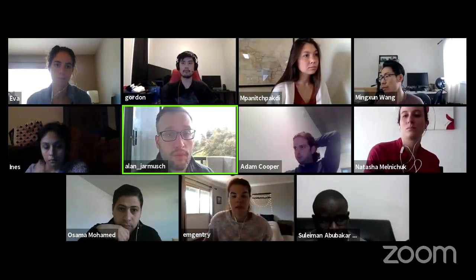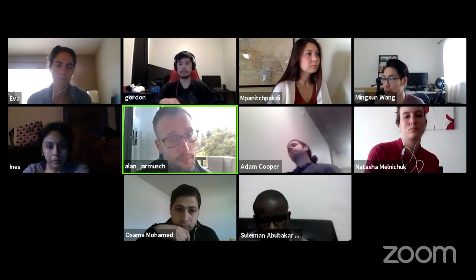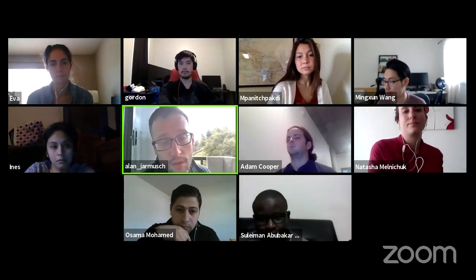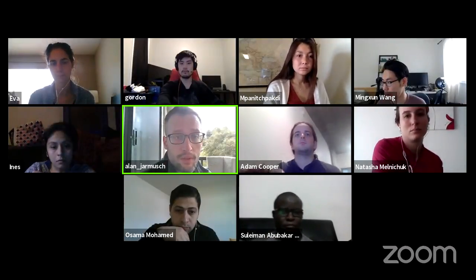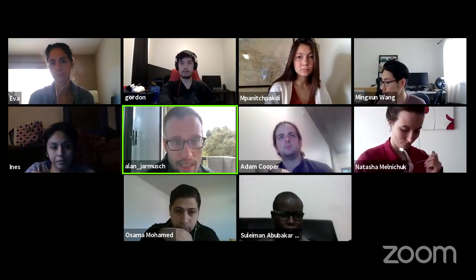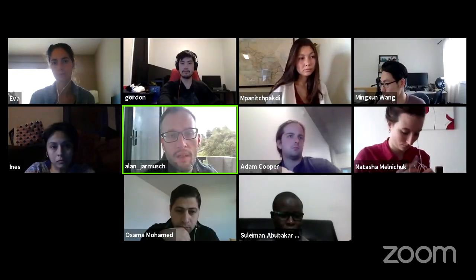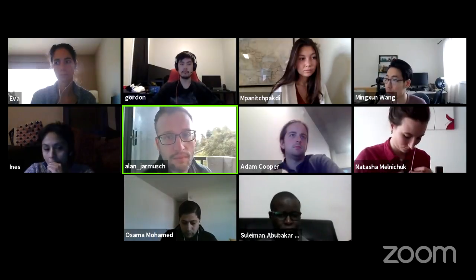And that's where the matching algorithm really is relying on you having multiple peaks and points of reference. Missing one of those doesn't negate a match at all. It just lowers the cosine score. So that's why we generally don't put the cosine score at like 0.99, where it really has to match identically. It's 0.7, it's kind of a fuzzy search, as you can think. So that's essentially how we currently handle the concentration issue.